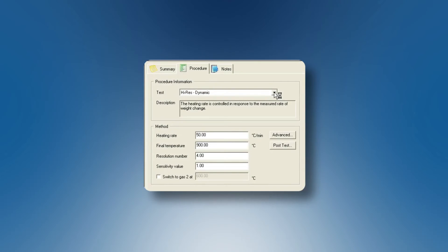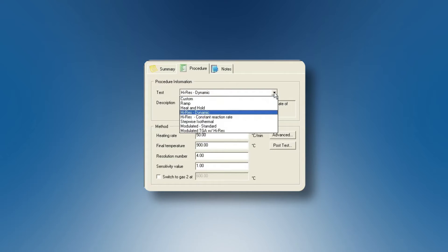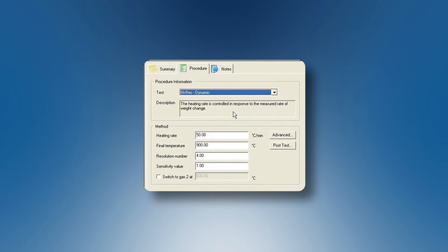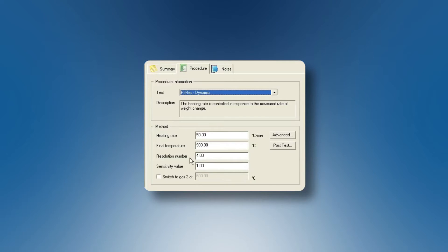To configure this experiment in our software is pretty easy. We only have to choose in the test high-res, for example, dynamic. We will choose the heating rate, which is typically larger to go faster when we don't have any transition. We choose the final temperature, and also two values that are very common: 4 and 1, for the resolution number and the sensitivity value.